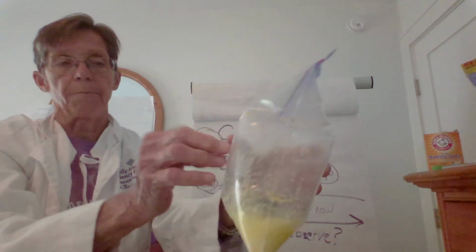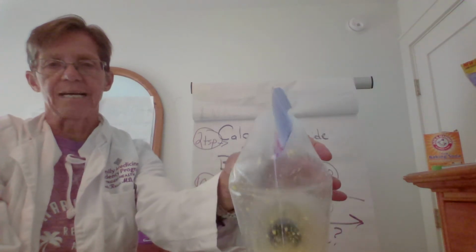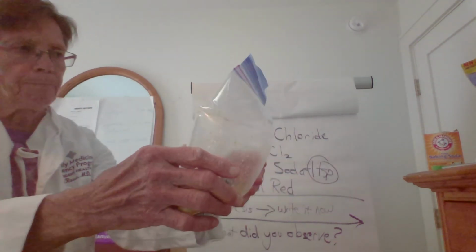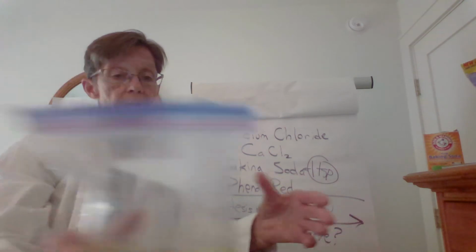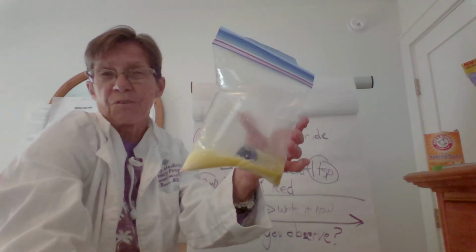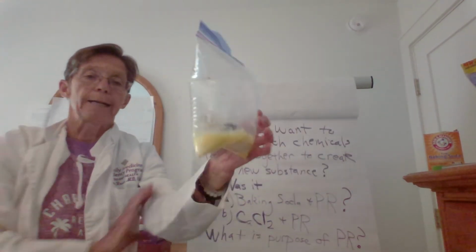I love this lab because you're actually blowing up a Ziploc bag, okay? Look at the size of this thing, okay? So what do you think it caused? What do you think happened, all right? Do we have a physical change or a chemical change, all right? So I'm going to pause it, and I want you to just kind of say, what do you think happened? Was it physical, chemical? Okay, so we're back now.